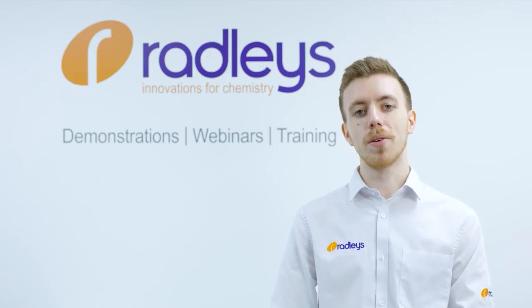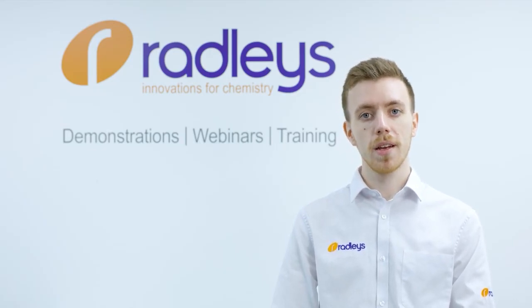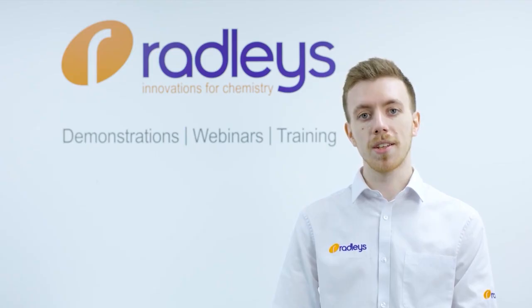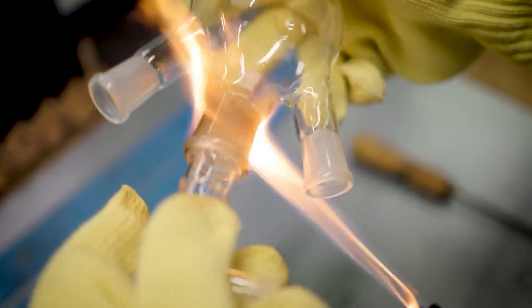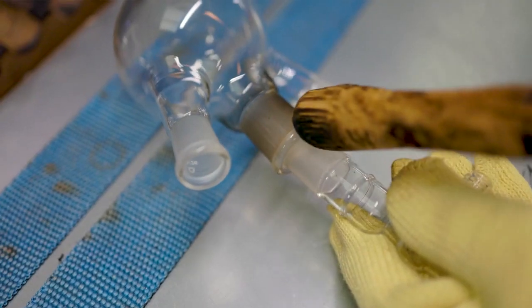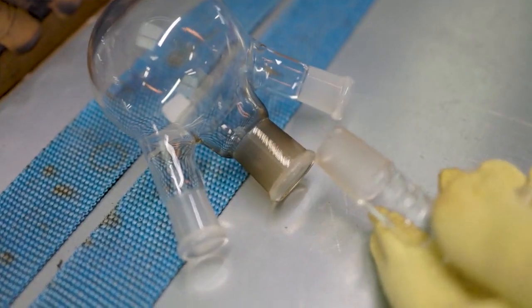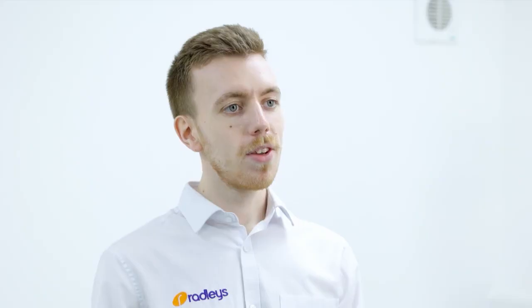You can also use thermal methods to separate your joint. Temperature can be used to expand or contract the glass. Some chemists put glassware in the freezer; others gently apply heat to the outside of the socket. We can use a glassblower's flame to apply heat to a joint, or you could use a heat gun or put your glassware in your glassware oven. Whichever method you choose, you should always consider your chemistry, and ensure any actions you carry out are safe for your specific setup. You should always wear the appropriate gloves and PPE to reduce the risk of injury should the glass break.